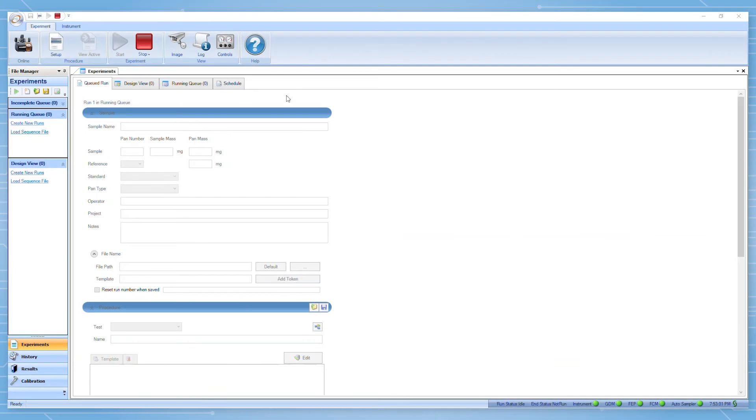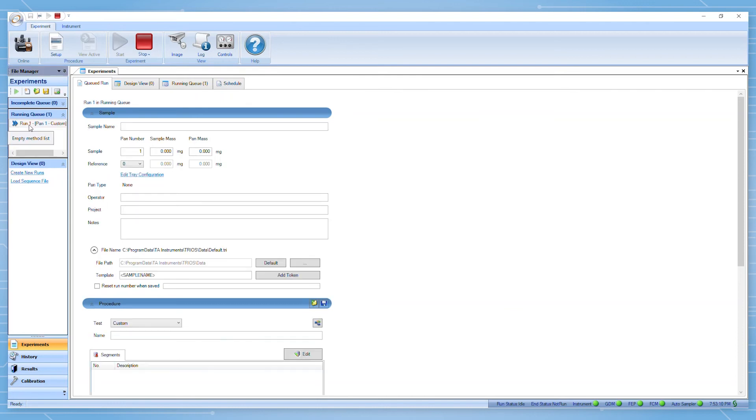You can verify the success of your calibration by re-running your standard material using the same experimental parameters as the calibration. You can even use the same pan you had previously prepared. This would just be run as a normal experiment.